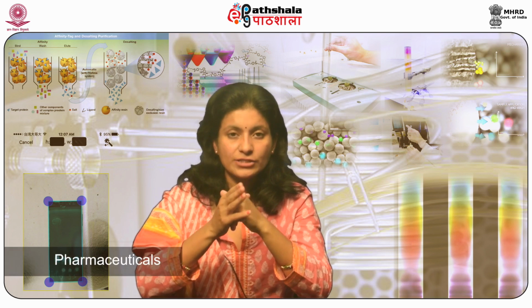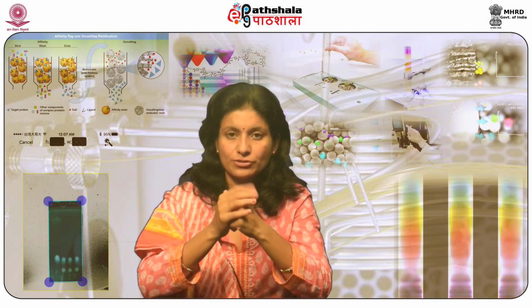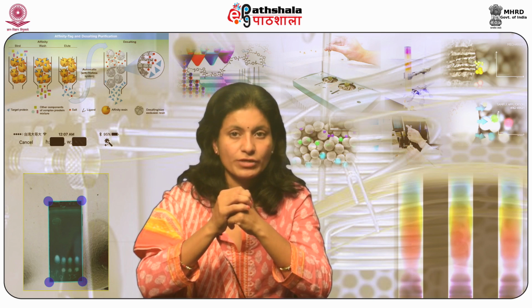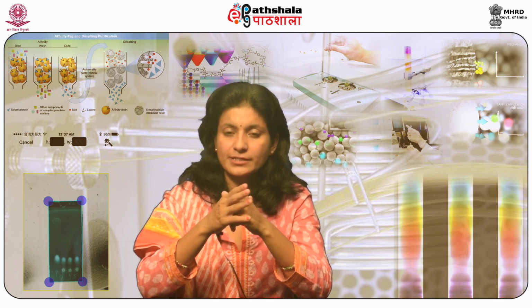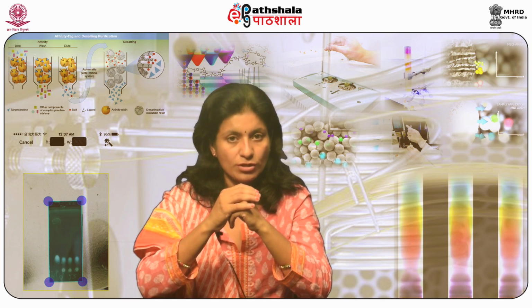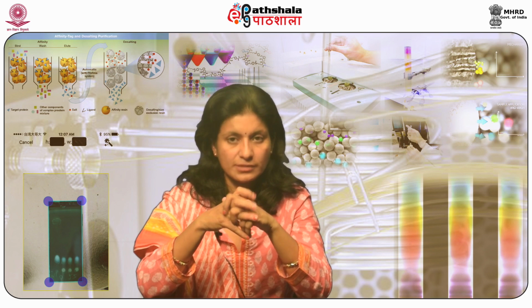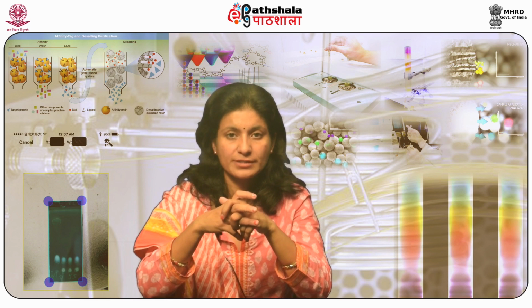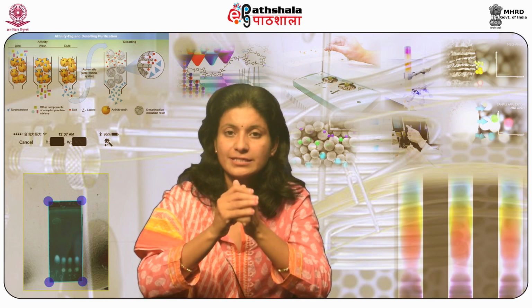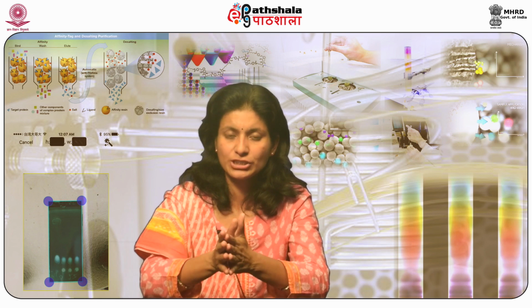Pharmaceuticals. Ion exchange chromatography has an essential role in pharmaceutical industries for the evaluation of integrity of medical mixing, determination of selected constituents, and in control production of drugs. IEC is a well-established process that ensures the drug has been manufactured as per sanctioned procedures and also certifies cleaning of the residues from the equipment utilized during the process of manufacturing.